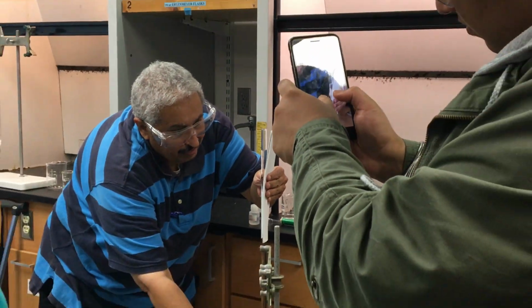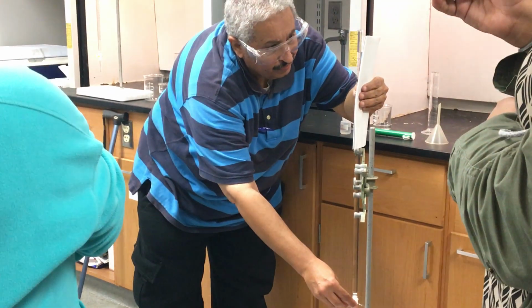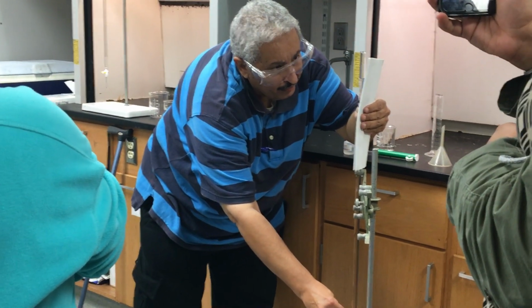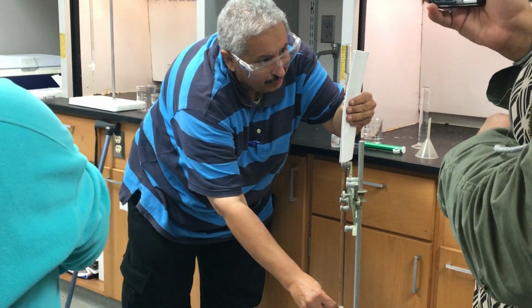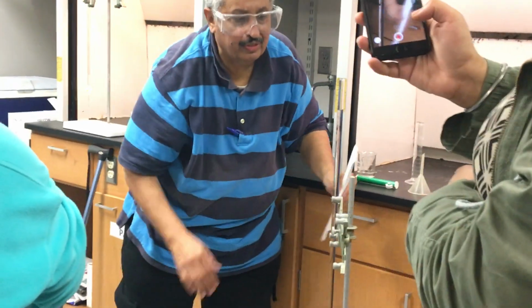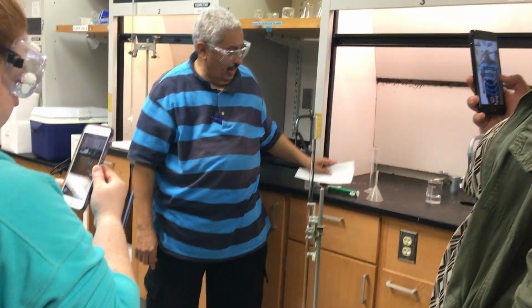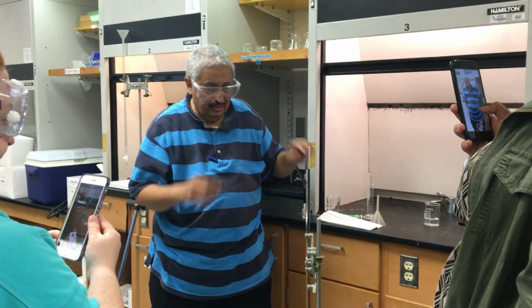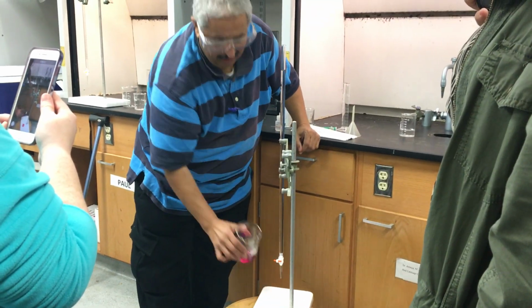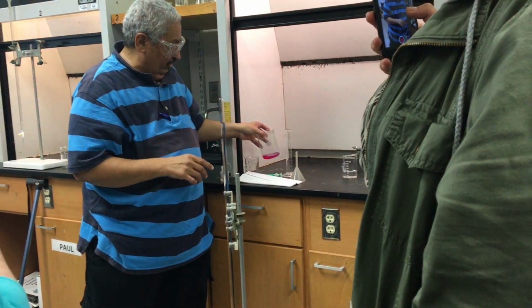So now I drain a little bit until I get to 0. I'm draining it slowly. Now it's exactly perpendicular on the 0 itself. So I use this one here too. Now this one is ready to go for titration. So that's my waste. I keep it all the time, and then at the end I dump it inside the sink and rinse it with tap water.